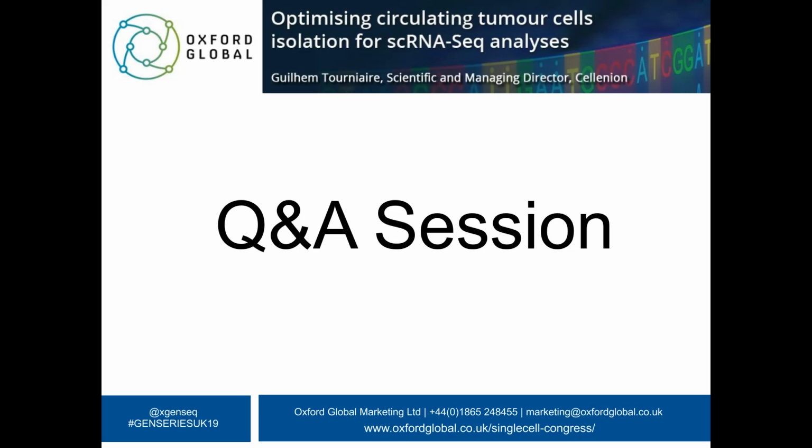So first question: have you looked at whether the CTC enrichment step and single CTC isolation had any effect on the cells' transcriptome? Actually, it's a very good question. It's one of the first experiments that was carried out. We did library preparation on bulk and single cells at the different steps: before enrichment, after enrichment, and after single cell isolation. And we saw very little effect of the different systems on the transcriptome. So we believe that there is no major effect of our protocol on those cells' transcriptome.